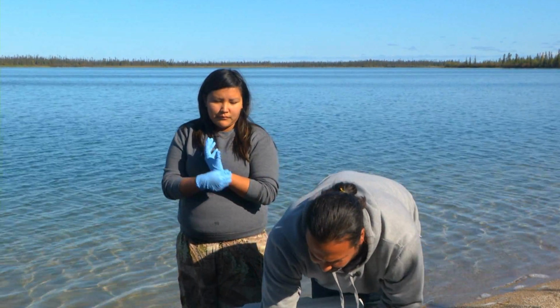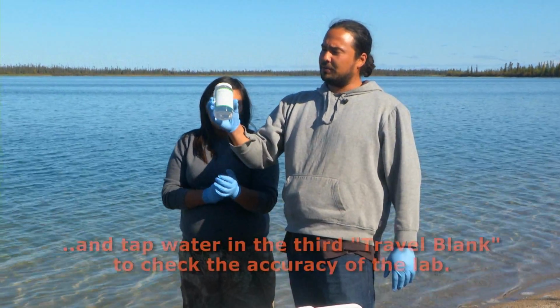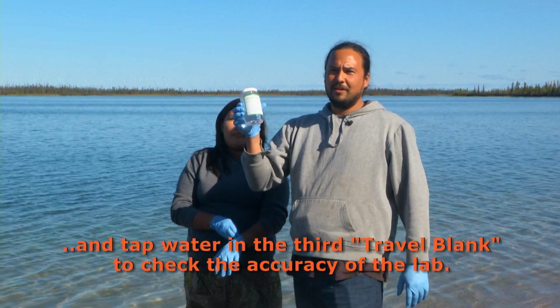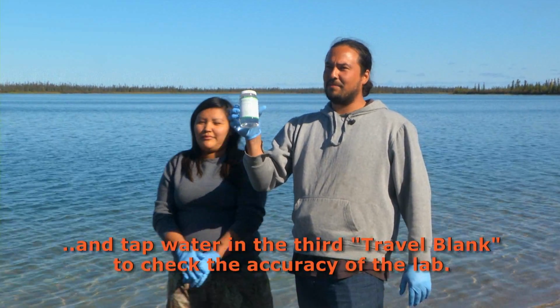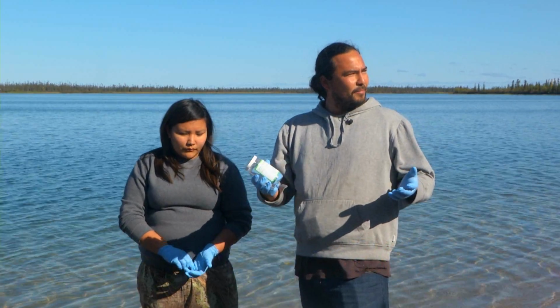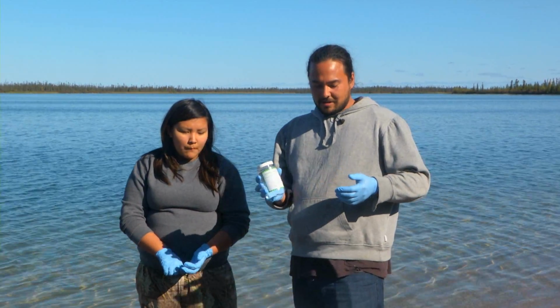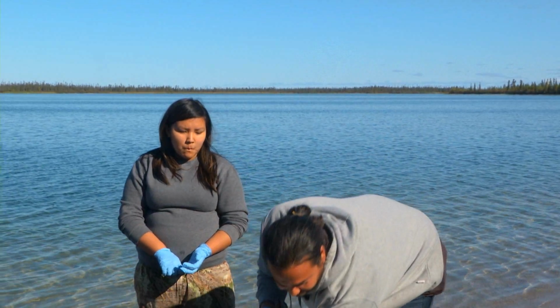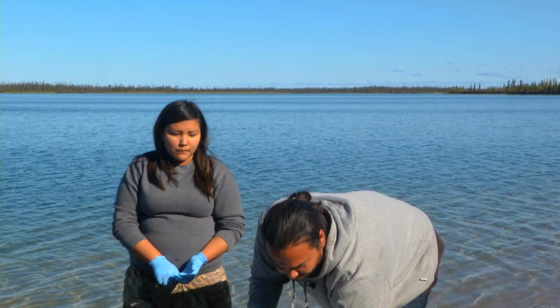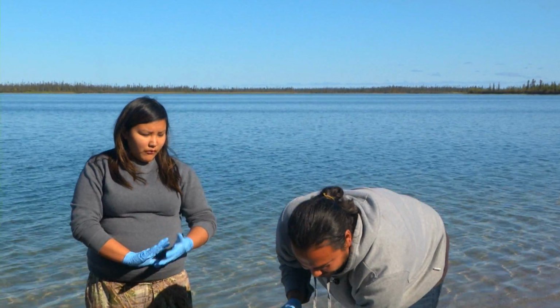And along with the samples, another way to test the lab, we send a travel blank. This one's already filled with regular water. So we'll send it in, and if the lab can't detect that it's just regular water, then we can say there's a problem with the lab, and they'll have to reanalyze all their information again. So that's basically just about it that we do for the water samples. And during the whole time, we have to use the gloves.